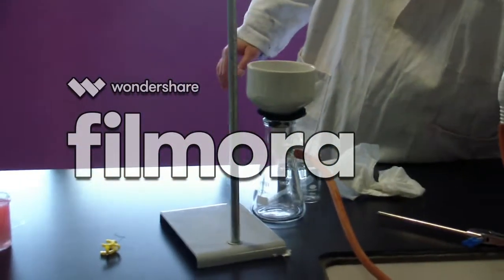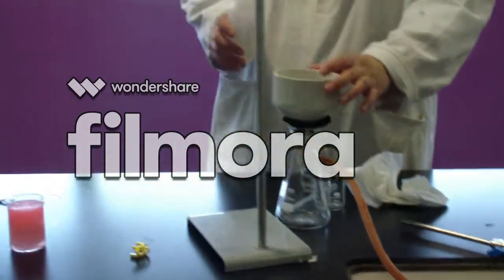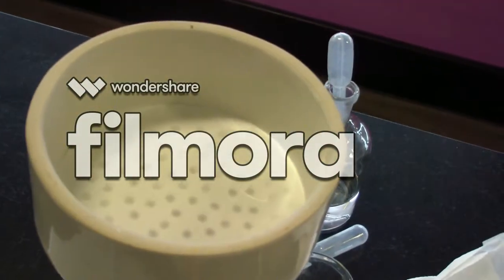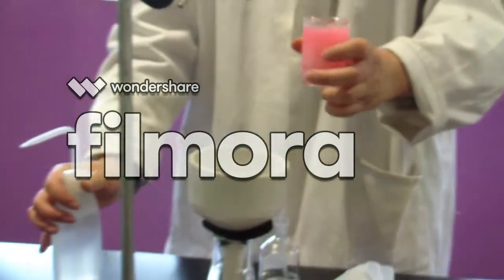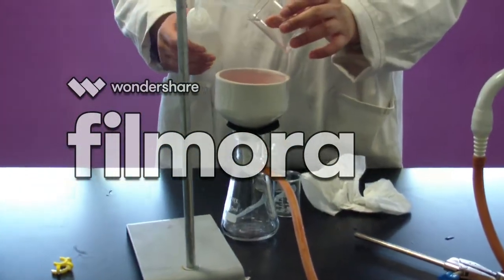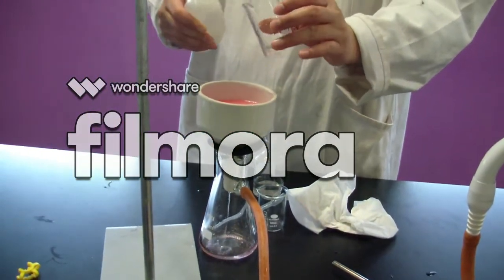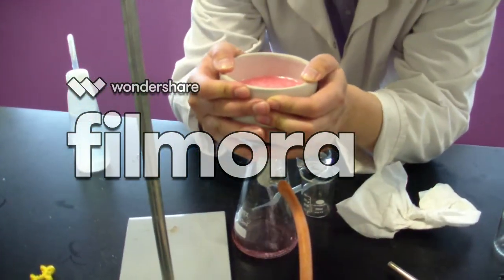Okay, so we turn on the water, and then we have to wet the filter paper to create the seal. As you can see, it's creating the seal. And now we slowly add our solution. And we clean the beaker with this water to ensure we get all of the solid. Just push it in, and then we help create the seal.